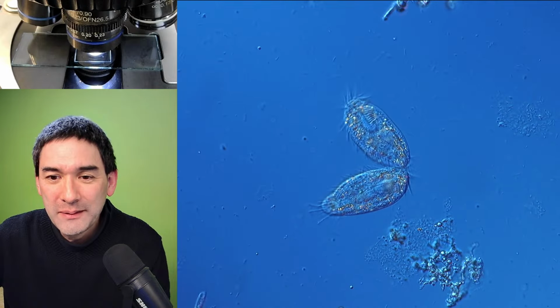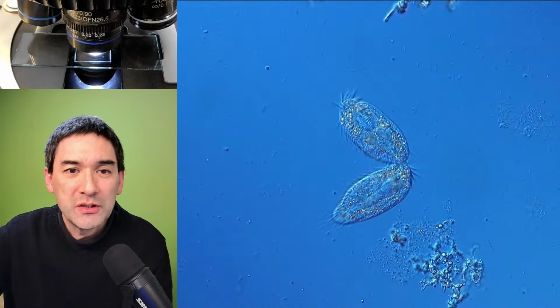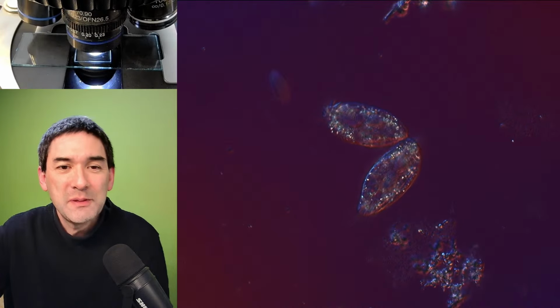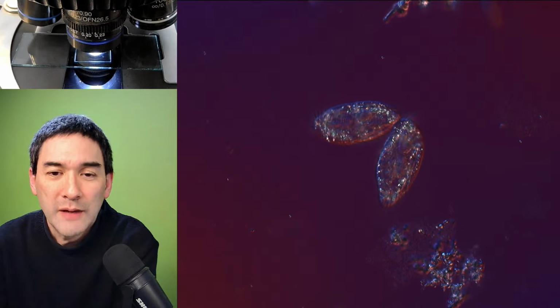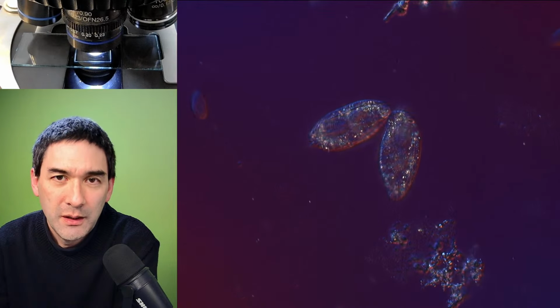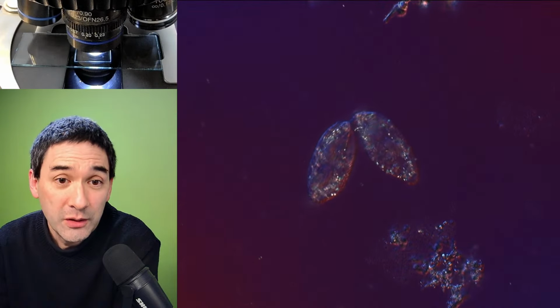Crystals, yeah, I think the question is why are these crystals? Because you look at this. There must be something in there that's kind of polarizing, and I know that people have already used them under cross-polarized filters and they've seen things. I don't know what they are.